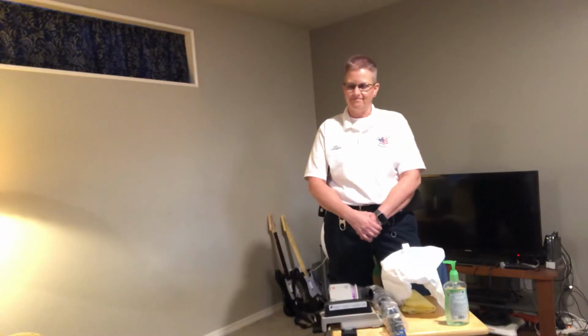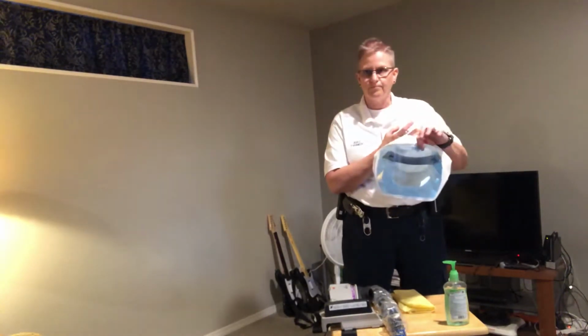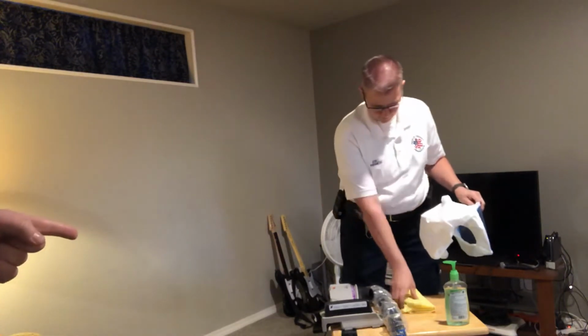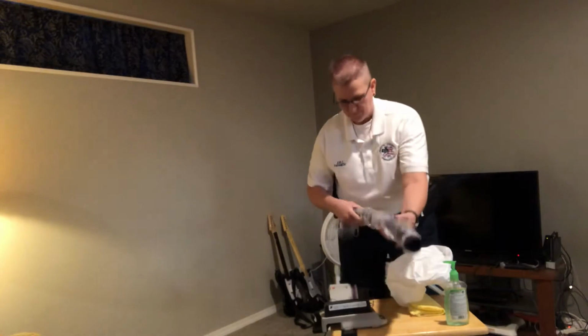I'm going to step out of the way and let Jody take center stage. So to begin, she's got all the stuff laid out. She's got the hood, which she showed you. Okay, she's got her gown. She's got the air hose, and it is covered.